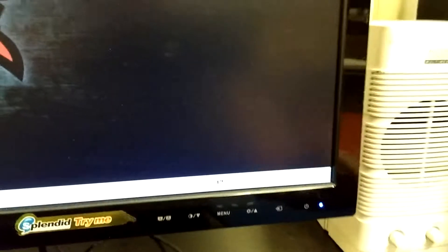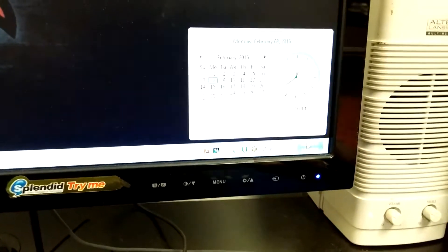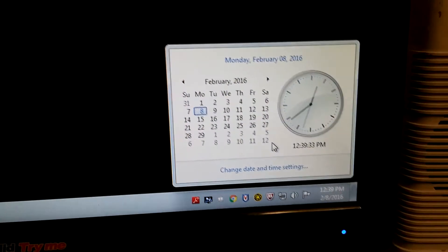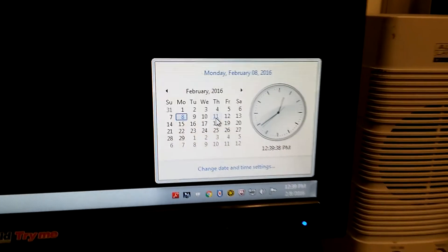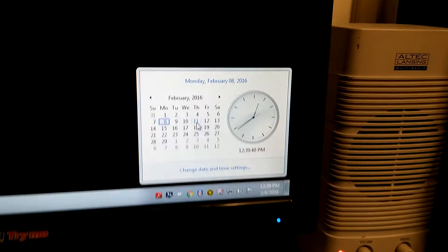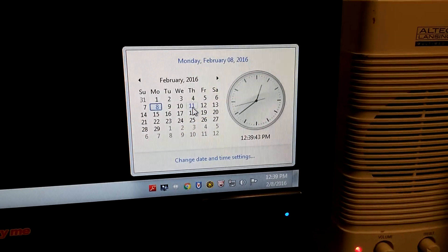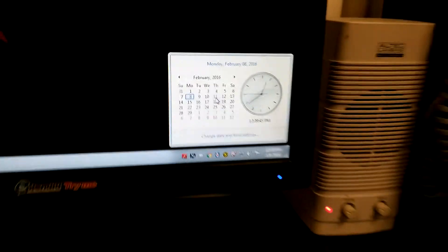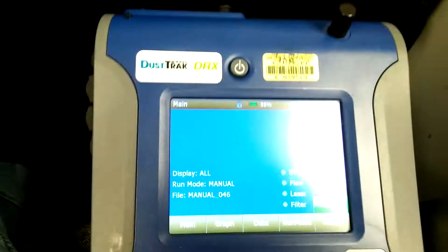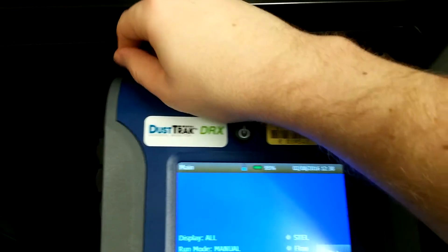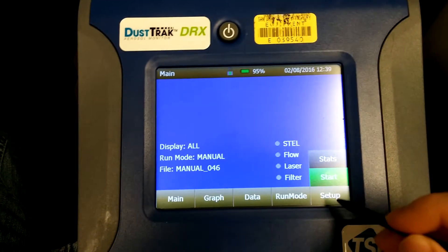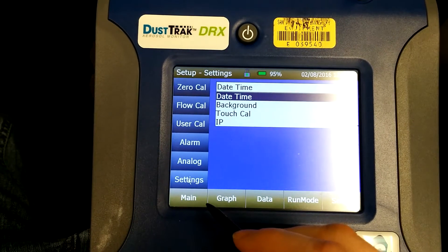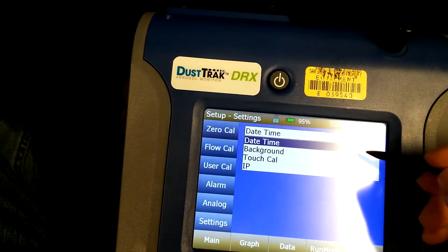Once your computer is synced up properly with your phone, you can either use your phone to sync with the DRX, or use your computer to sync with the DRX — I'm using the computer because right now I'm recording with my phone. On the DRX, get your stylus and go to Setup, then Settings, and Date and Time will be highlighted.